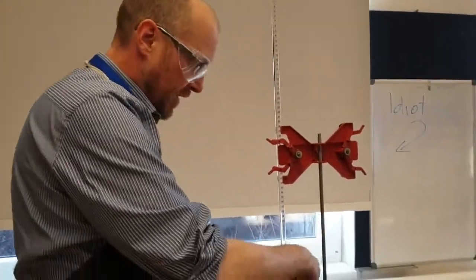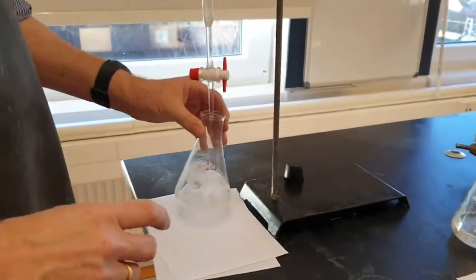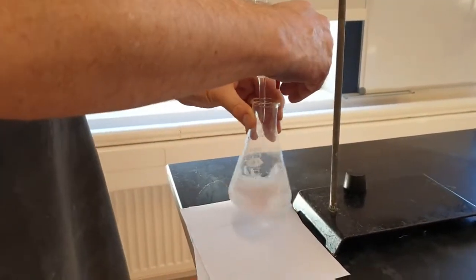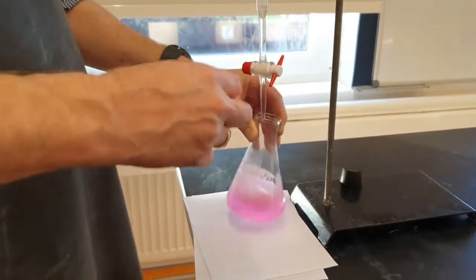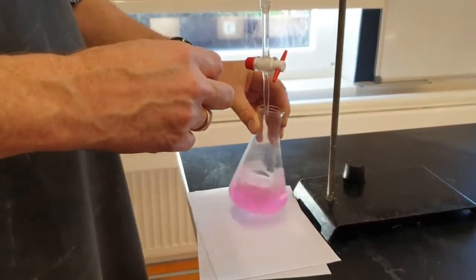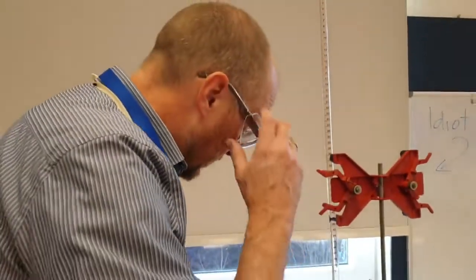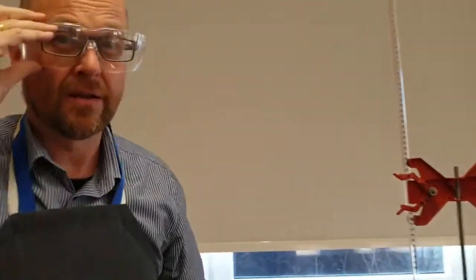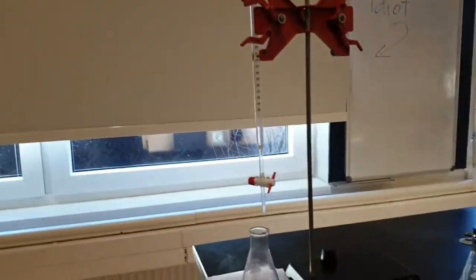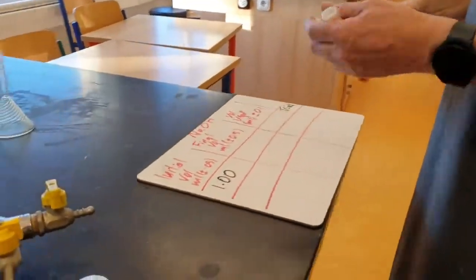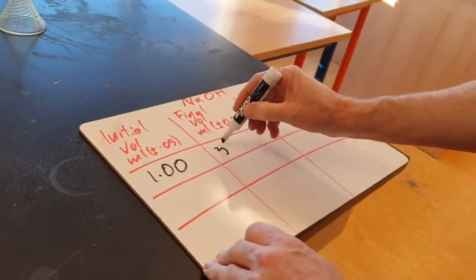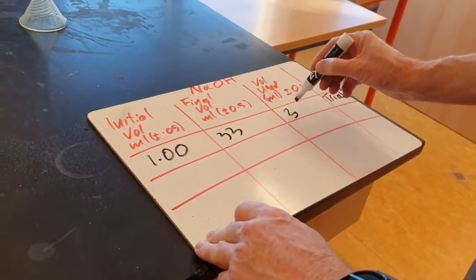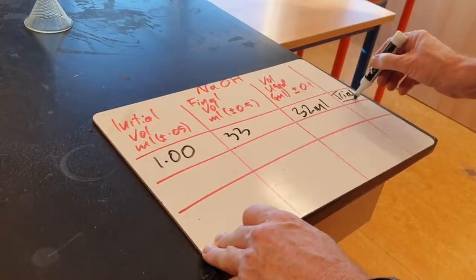So the first one is a trial. I'm just going to let it go and then stop when there's color change. Alright, so I've gone past the endpoint of the reaction. That's my trial. So what have I got here? I've got about 33, you don't have to be too accurate. So I come over to the data table, so 33 give or take, and so that's going to be 32 milliliters. But this is the approximate one, the trial.